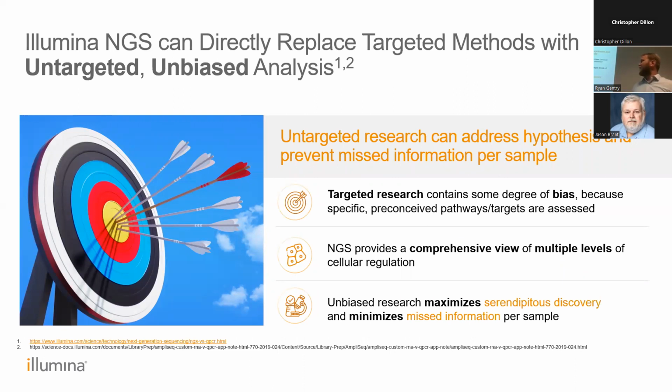What that allows for, again, is an untargeted and unbiased approach. We can just go in and look at everything, and then define later what we want to look at. If we do a whole genome approach and find specific genomic markers present in the tumor type, then we can develop a targeted panel, and then specifically use that panel to find our patient stratification based on those specific genes, or transcripts, or proteins, any of the sort that we can do.